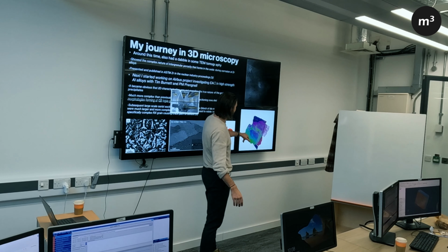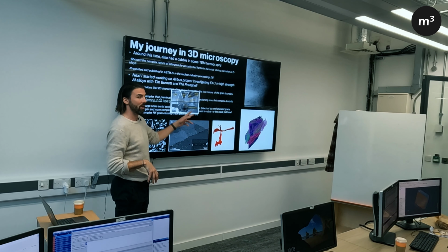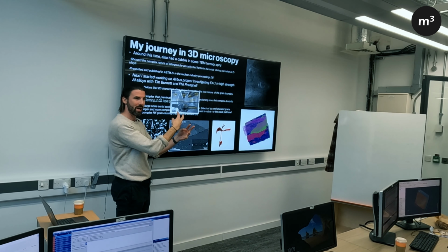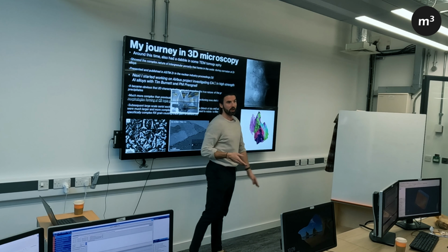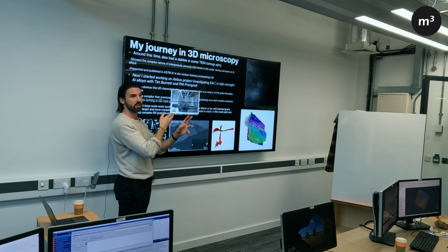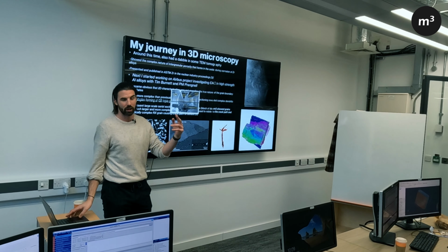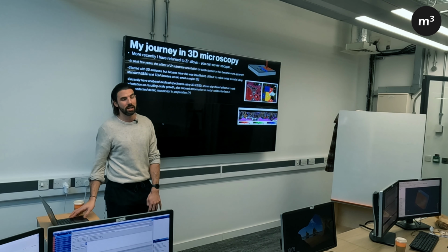So this is the resulting 3D microstructure here, which showed these really long platelet-type grains. And it told us a lot about the microstructure itself in terms of the length of these grains, how intertwined they are, and how the recrystallized grains form between them in these really complex networks, which you totally miss in 2D. And then we were able to segment the crack going through this microstructure, and we found that the recrystallized grains result in the crack path deflecting. So this was a really big realization in the propagation of these cracks, which really helped the advancement of understanding how the microstructure affects the crack propagation.